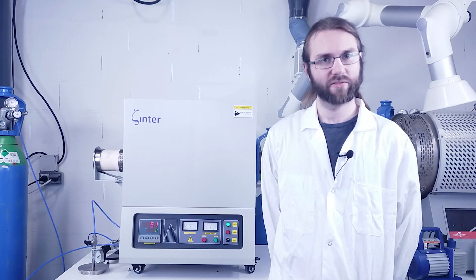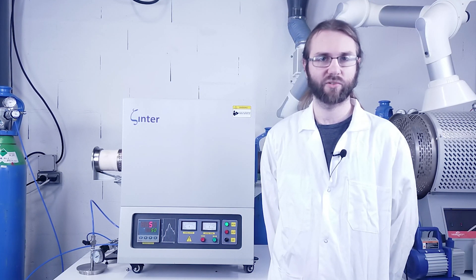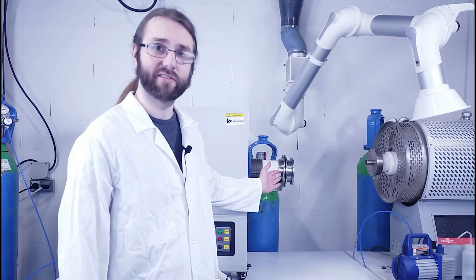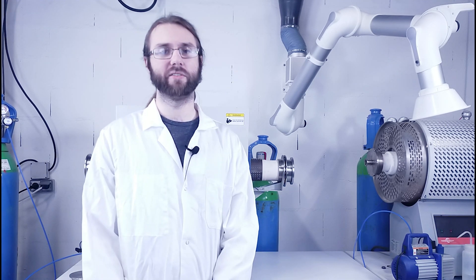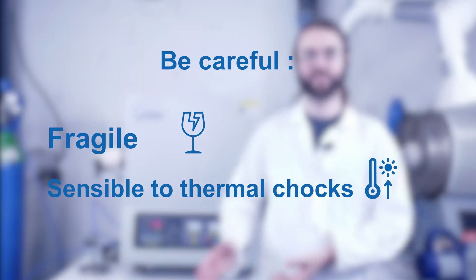Now that we know everything we need about sintering, let's launch a run. We are going to start with an already installed furnace. You can find all the instructions to set up your furnace in the video dedicated to it. For ceramic sintering, we don't need to use the flanges. We use the flanges only for metal sintering, which will be the topic of our next tutorial video. Be careful — the alumina tube is fragile and prone to breaking due to thermal shocks. The maximum ramp usage is 200°C per hour.